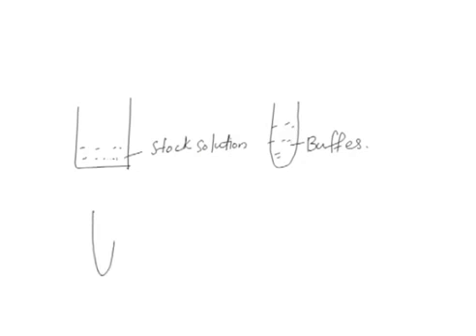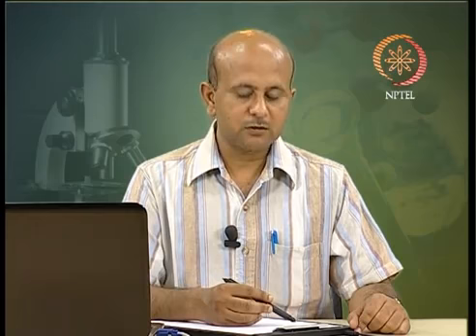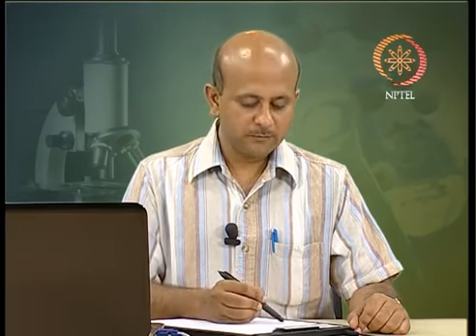As per your calculations, you take the buffer and a certain amount of the stock acrylamide solution and mix so that the final concentration is 10%. All right.